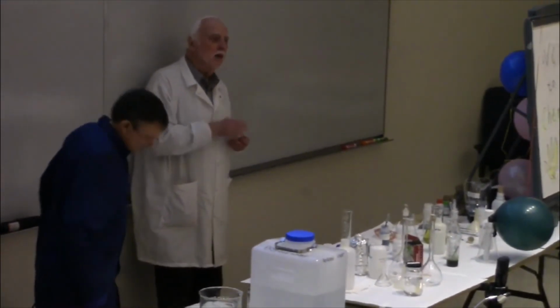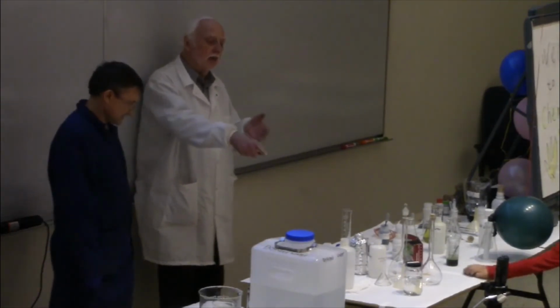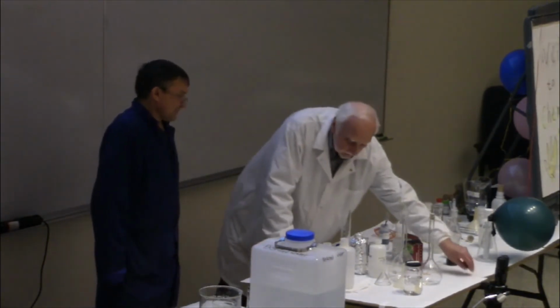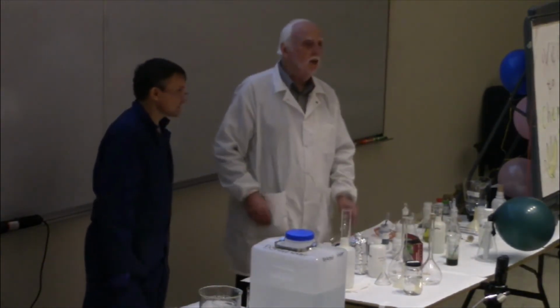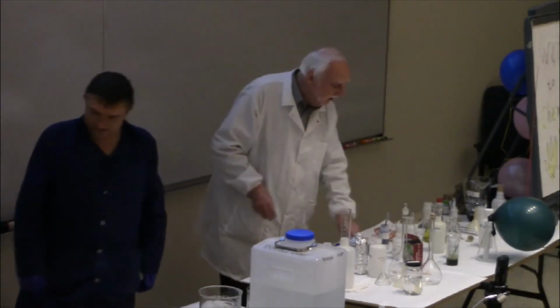It blows up because we had a vapor reaction with oxygen, we get CO2 and water, but the temperature is very high, so it expands and blows everything else. So I want you to leave thinking that not all oxidation reduction reactions are violent. We're going to do one that's very benign.